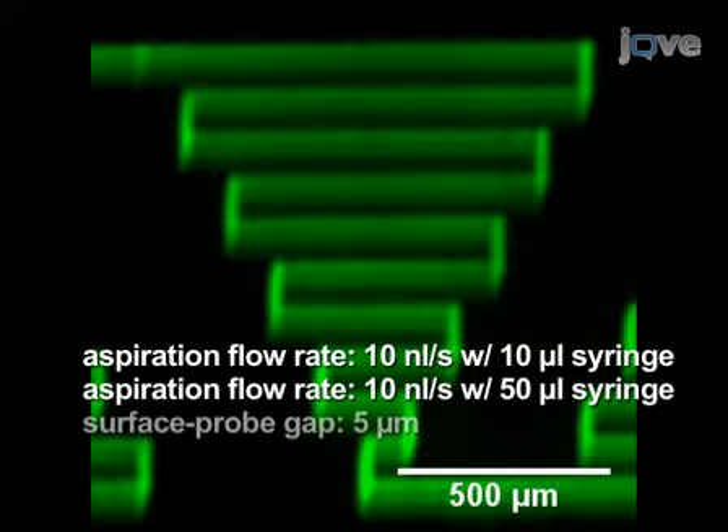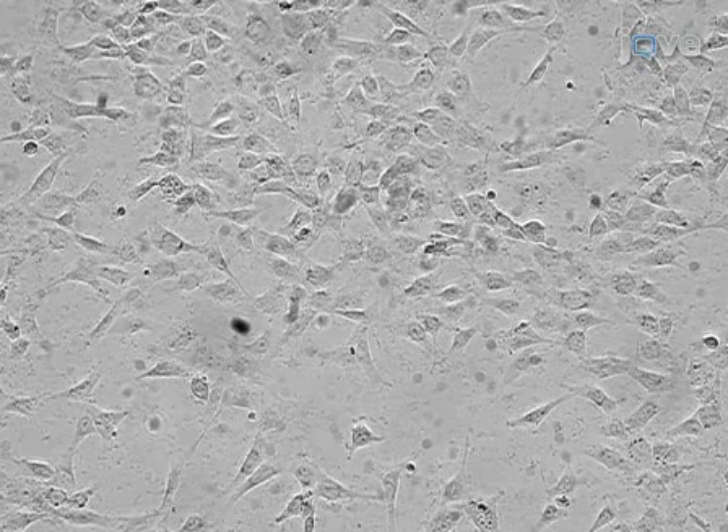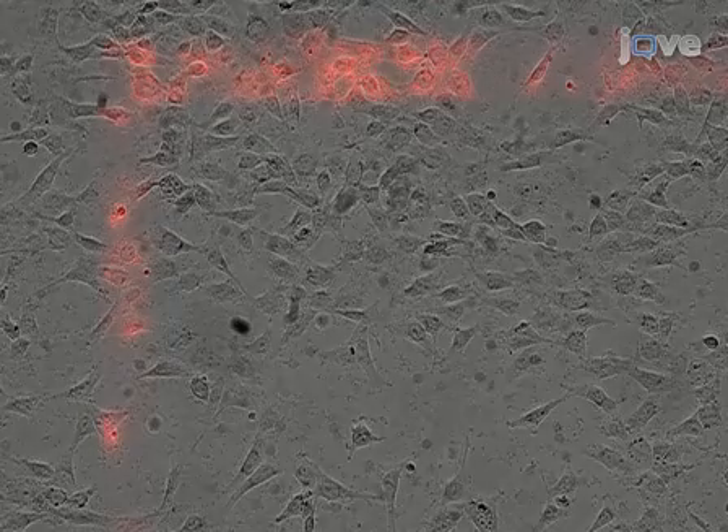The gap between the surface and the probe was 5 µm. The MFP can also be used for local staining and processing of cells and tissues. The flow confinement prohibits diffusion of the reagent and allows precise chemical staining of cells, as shown here. A monolayer of fibroblast cells was stained with 100 µg per milliliter of dye.